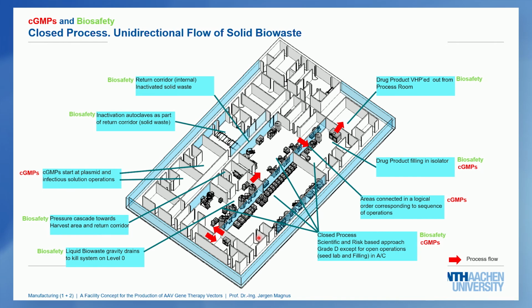And therefore, you have to consider the full GMP guidelines also in the production of the plasmid, even if it's strictly just a starting material in your process. And this is then done, therefore, inside a production facility according to those standards as well.